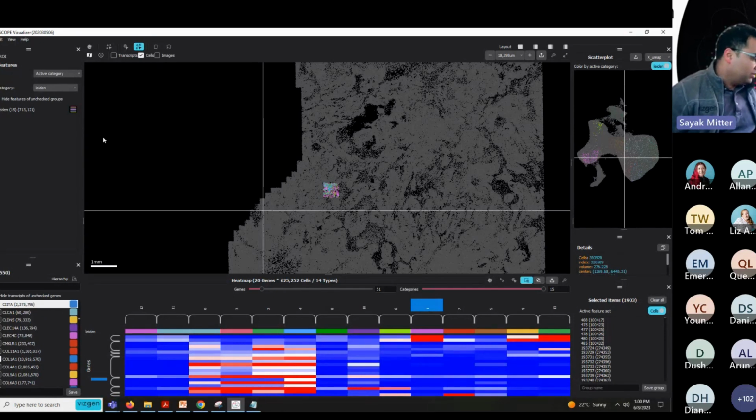As an additional precaution, Vizgen has manufactured, and we sell separately, something called a photo bleacher, which is extremely effective in taming the fluorescence of your protein. For users who have samples expressing GFP or a fluorescent protein, I strongly recommend that you first photo bleach for about 3 hours and then run it through the instrument.